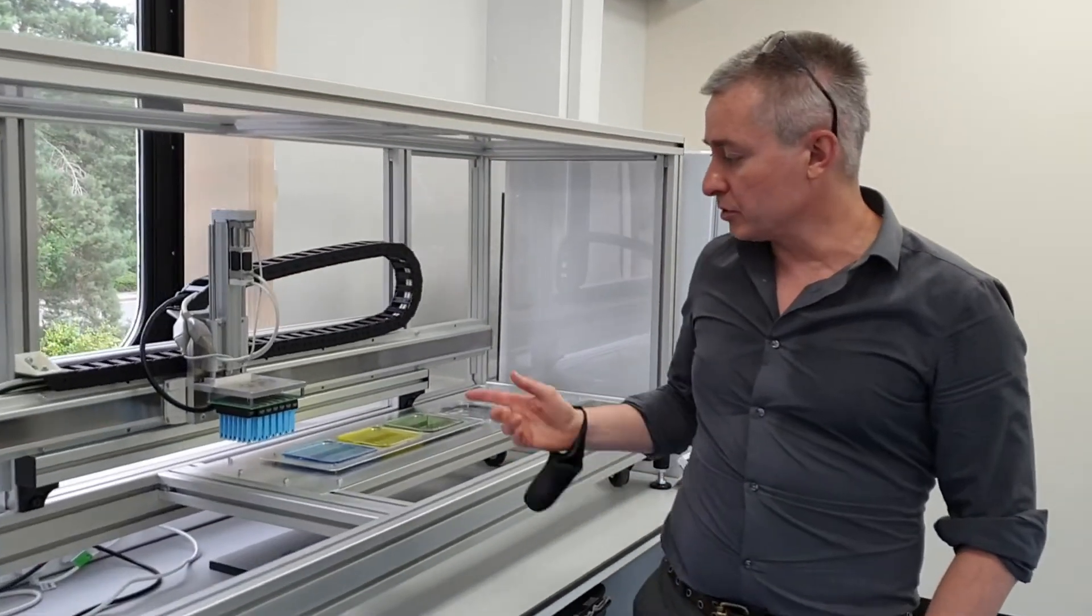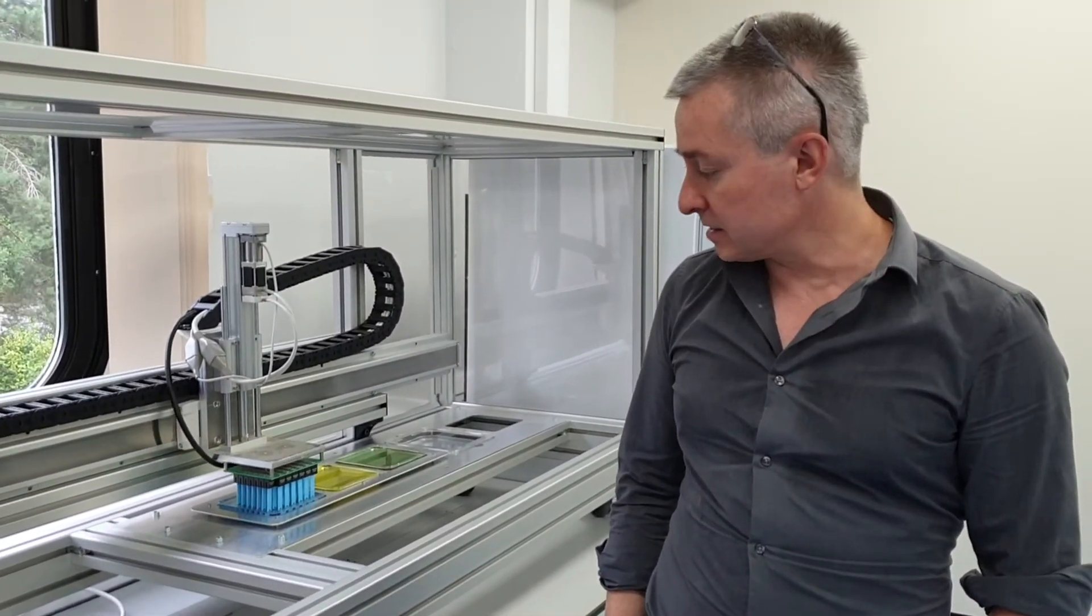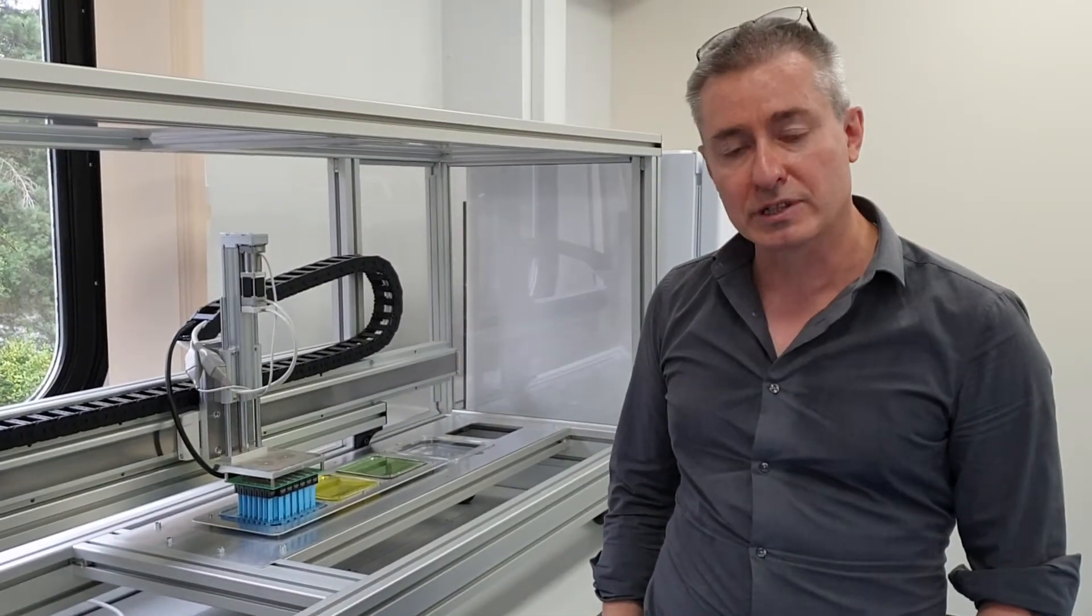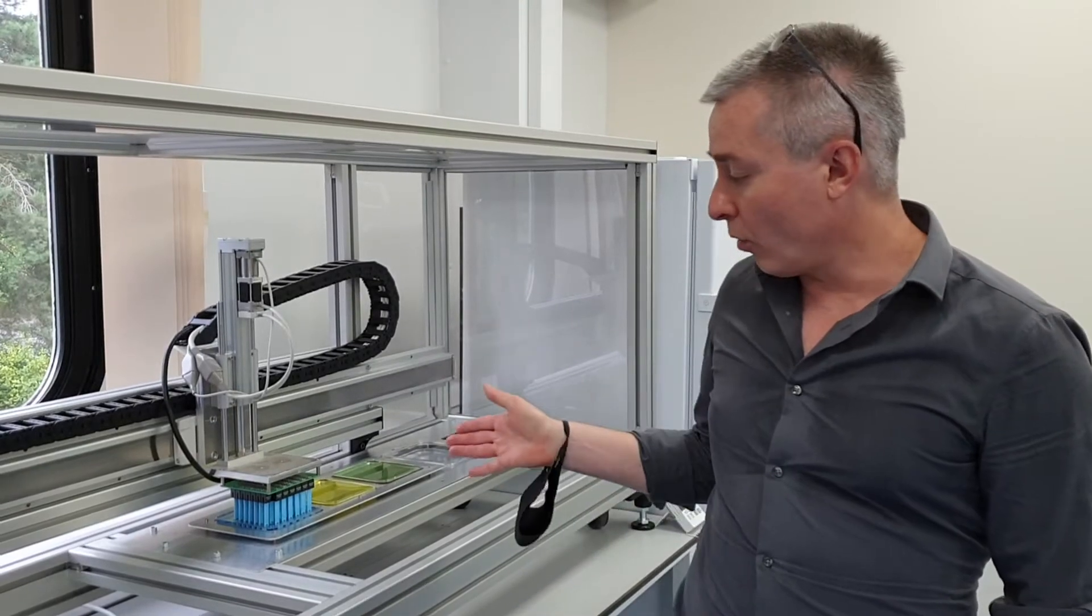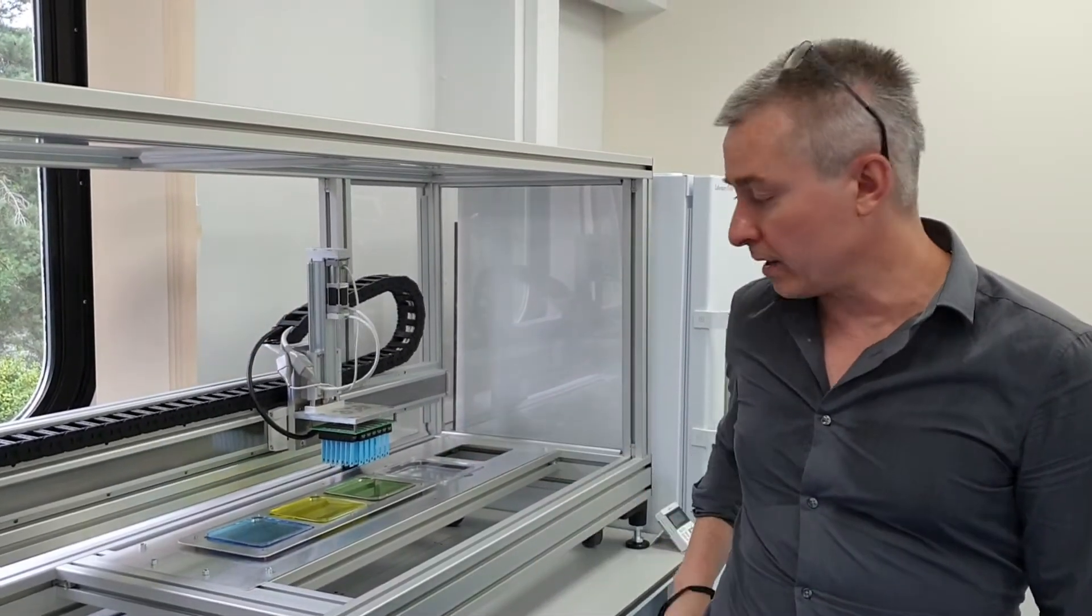So this robot that you can see here, we've got approximately 50 sensors or 50 screen printed electrodes at the moment on the robot. You can see these little black connectors. What makes this robot quite unusual is it's moving from station to station.